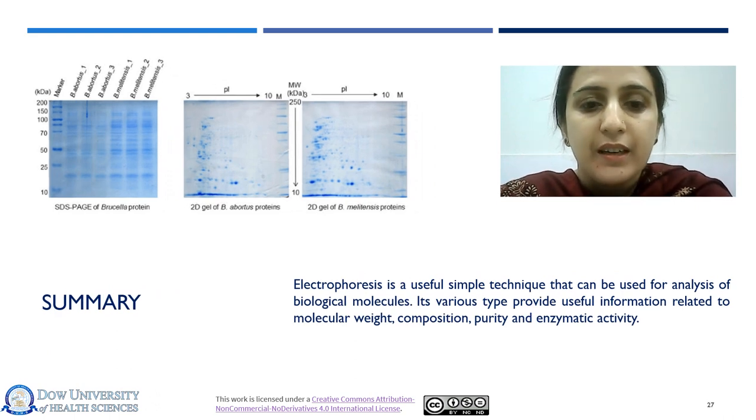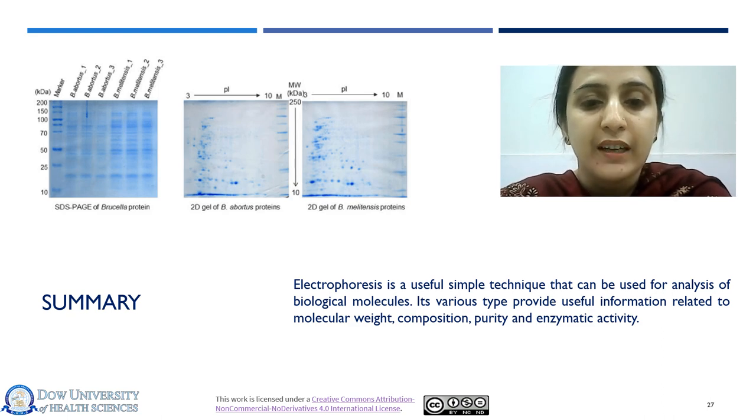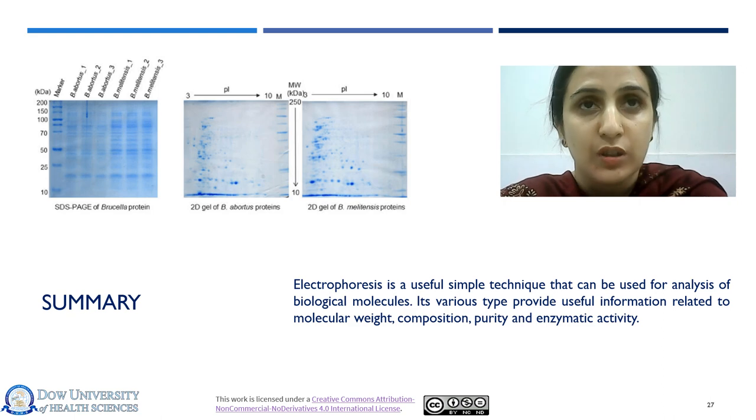So in summary, I would conclude this topic here. Electrophoresis is a useful technique that can be used for the analysis of biological molecules. Its various types provide useful information related to the molecular weight, composition, purity, and enzymatic activity of your sample.